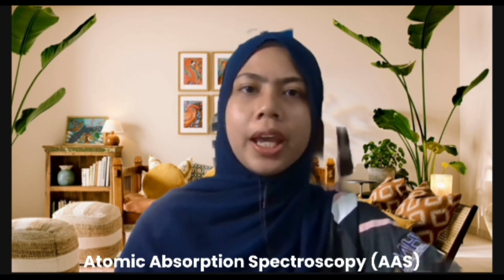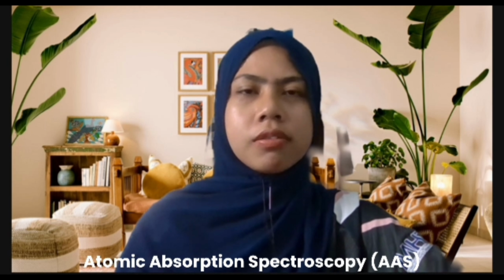For the last question, suggest an alternative analytical technique for Na and K determination. The alternative analytical technique is atomic absorption spectroscopy, known as AAS, which is a suitable technique as it provides higher sensitivity and selectivity for metal ions such as sodium and potassium, especially in complex matrices after acid digestion.